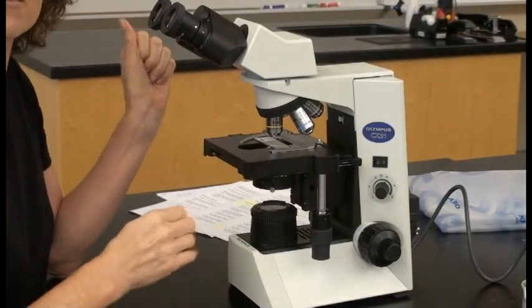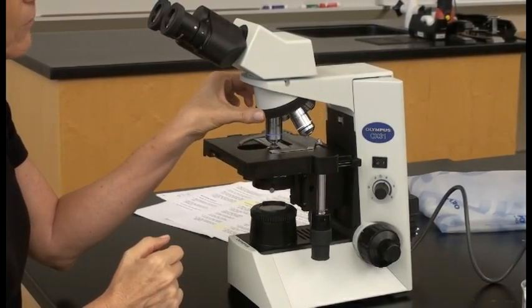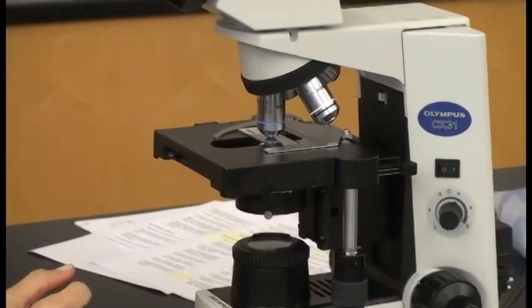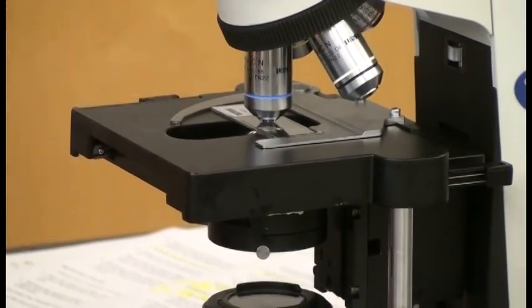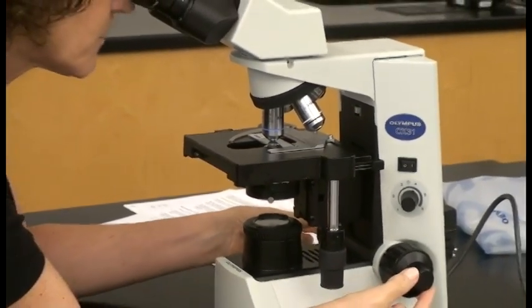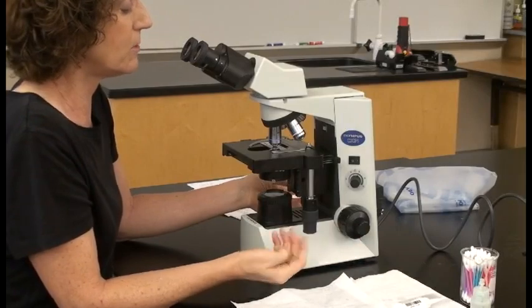Once we have it under 10x and want to go to higher power, leave everything as is and only rotate your magnification objectives — we're going to increase it to the 40x. Notice there's only a very small working distance between the objective and the slide. Since it's such a small amount of room, you only want to use your fine focus knobs to get the 40x objective in focus.